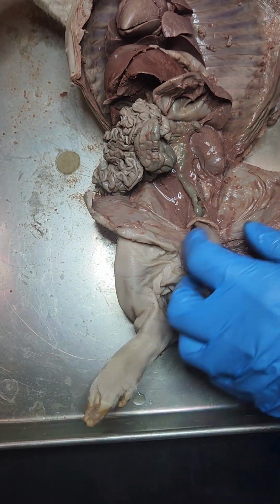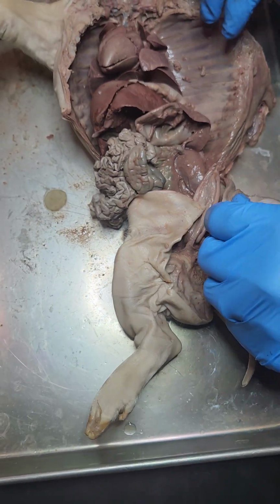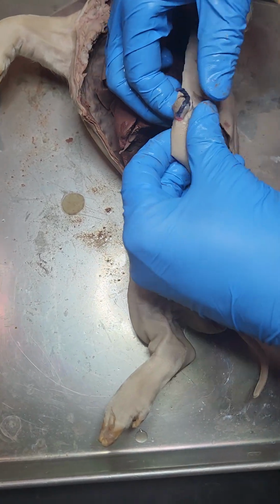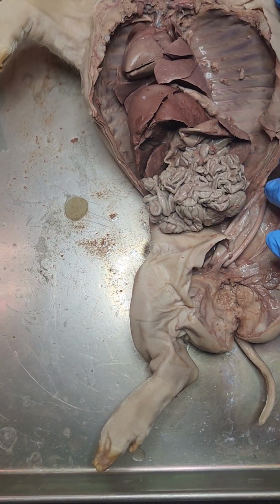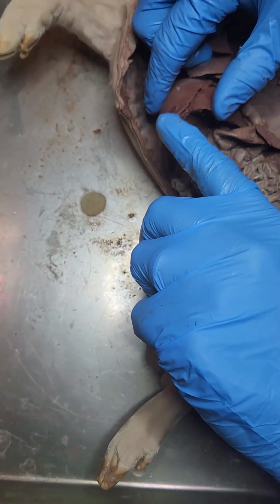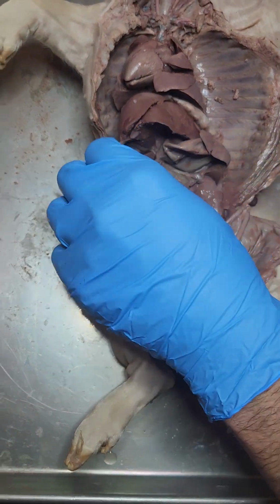Urogenital opening. So let's see what we have here. We have a male, so the urogenital opening will be somewhere through here. Here we are, right there. That's the urogenital opening right there. That would be where the penis is. Umbilical vein. Umbilical vein attaches to the liver, so it's right here. It's umbilical vein. Now the renal artery and renal vein are the last two.